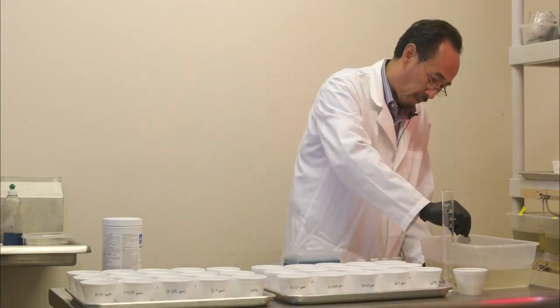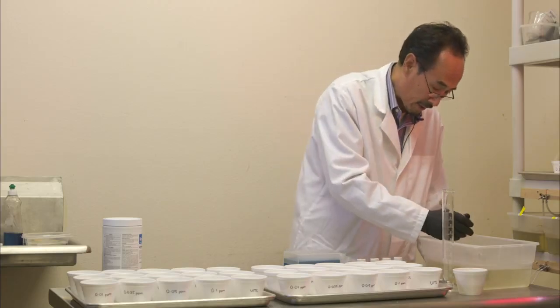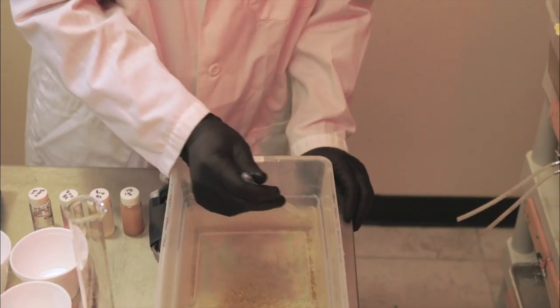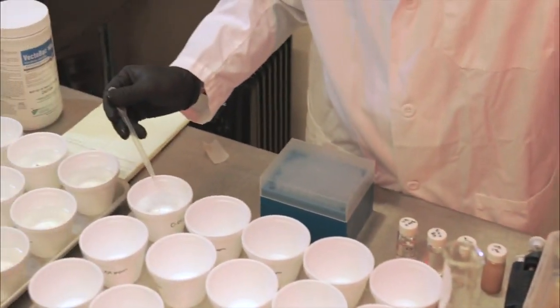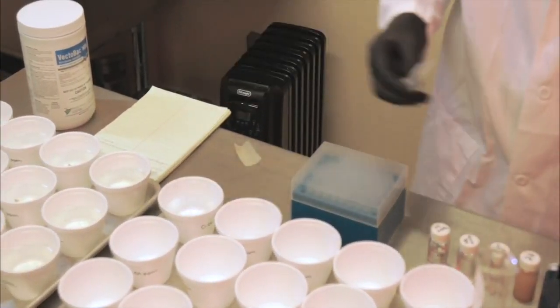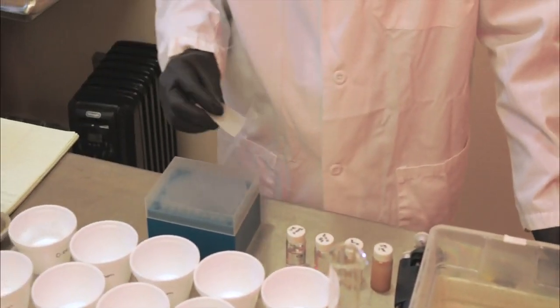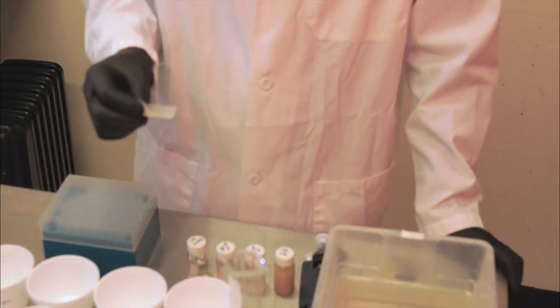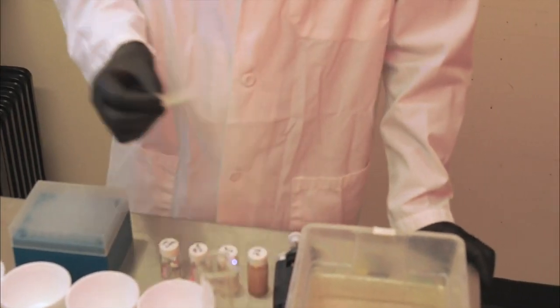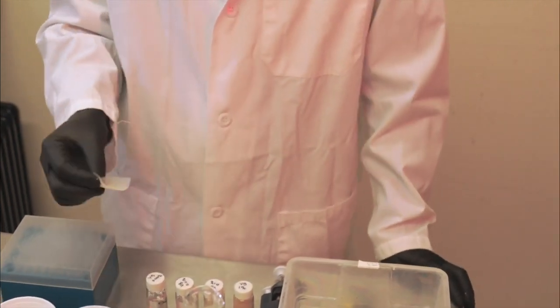And of course, some people use a dropper, but with the dropper you have to control the water volume to minimize the water volume. You can get one larva with a very small amount, but it can be time consuming, can be a little difficult. So the screen is better. Sometimes you use the finer screen if the larvae are on the smaller side, because with the bigger screen, some larvae go through. And when you are doing that, you are doing a screening of the larval size.